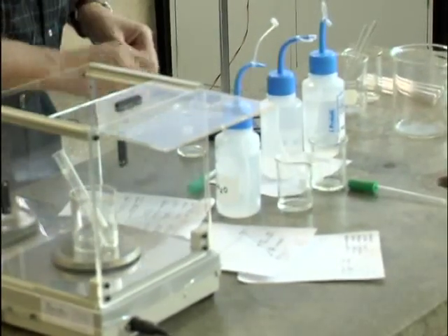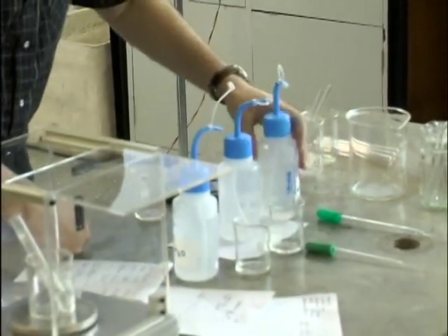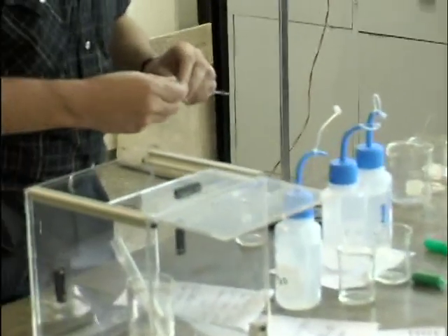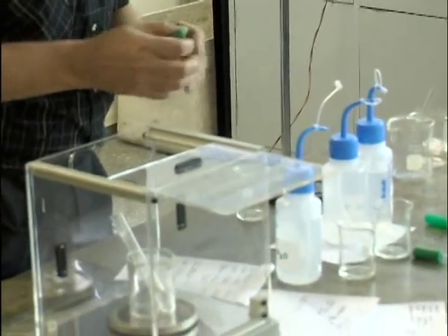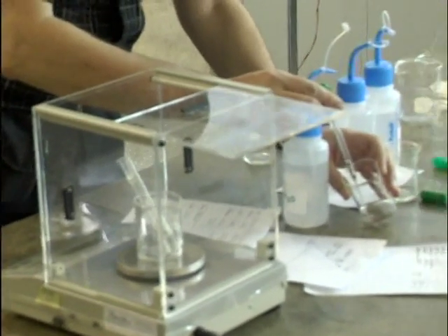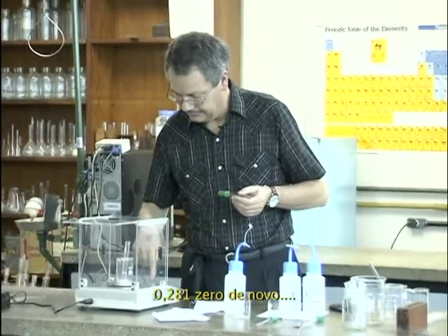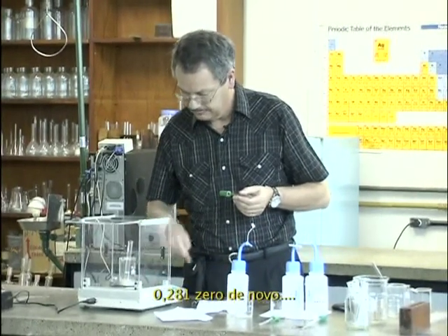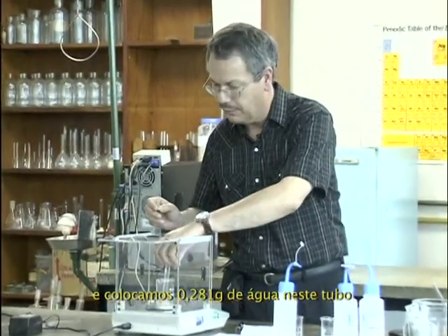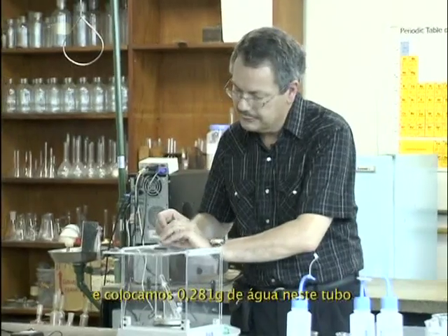Let's put it back here. 0.281, zero again, and I will drop 0.281 water in this tube.